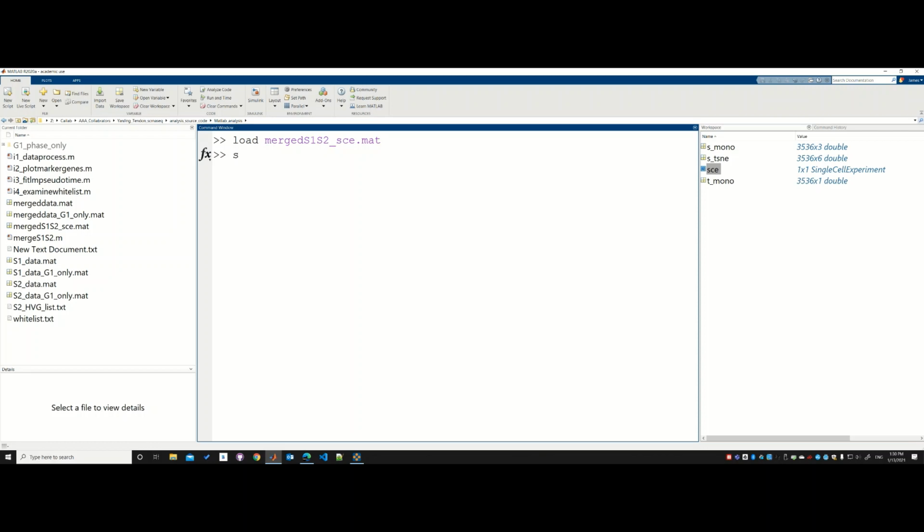Now the next step, you will scatter plot. Remember, you had the scatter plot of SCE, which takes the big X expression matrix and gene list as input. But here you want to use another function called scScatter underscore SCE.